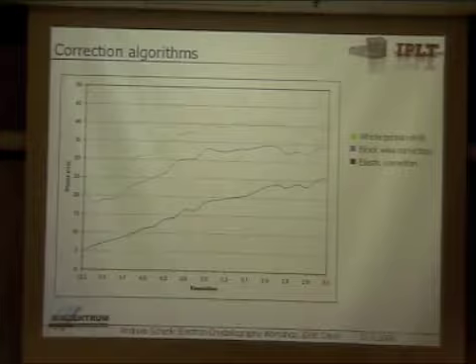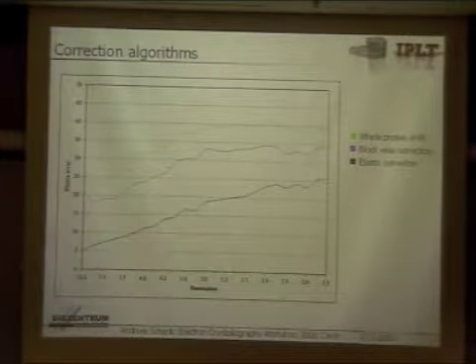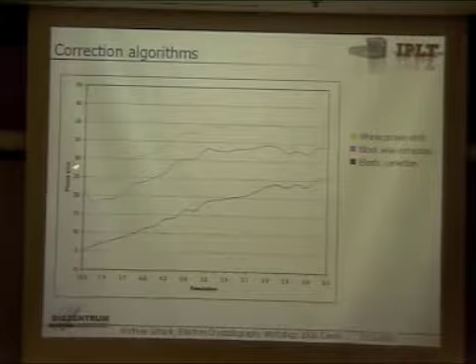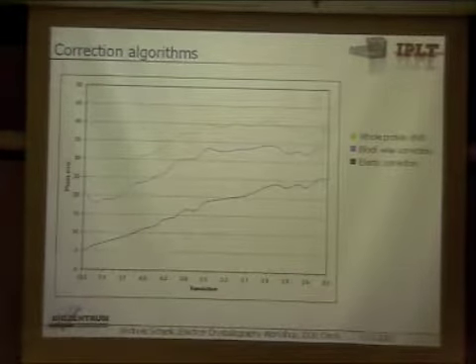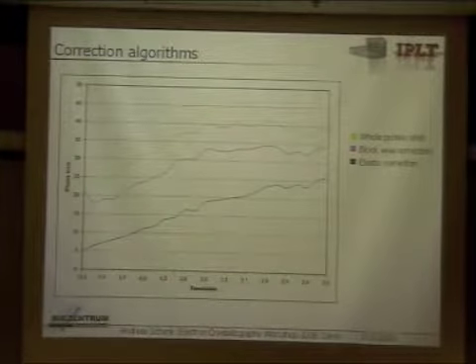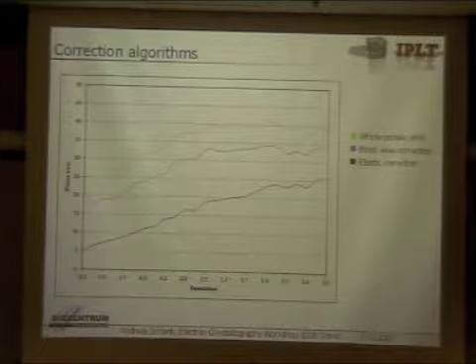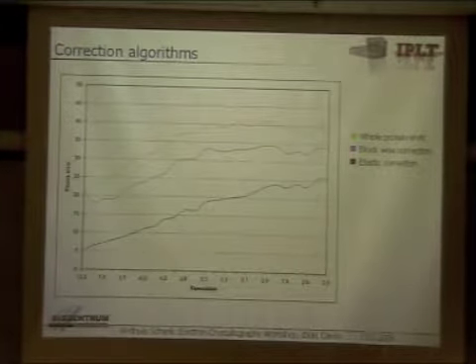Okay, that's the second plot that I just made, which compares the different algorithms. As you can see, the one that just shifts the protein back without any rotation performs worst. That's what I expected, but I wanted to see if it's really important to correct for the rotation.